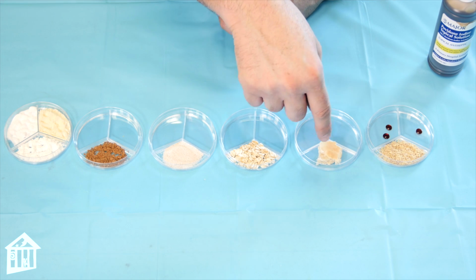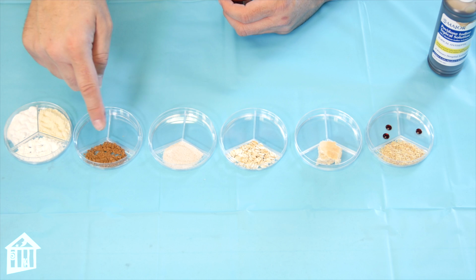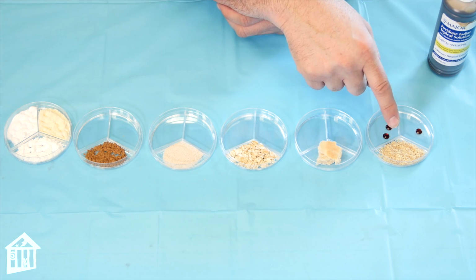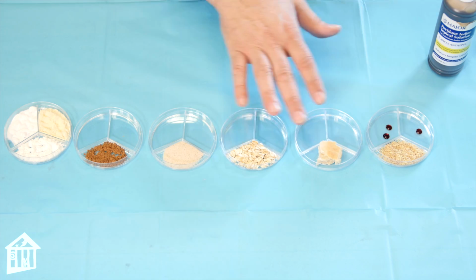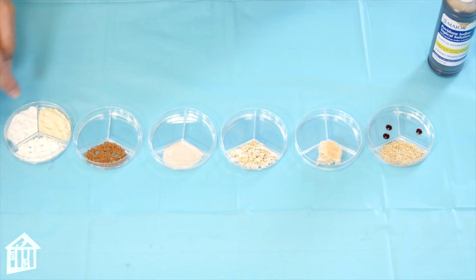But you know, this is a piece of bread. I'm pretty sure this is probably oats from oatmeal. This one I'm not too sure of. This is probably cocoa. I'm thinking this might be wheat germ, I'm not certain. And over here, we'll get to this later. I'm gonna talk about these three in a second, okay? So you'll notice that I have 3 chamber petri dishes in all, but only one item in each of these. I have all 3 items in each of this. I'll talk about that in a moment.